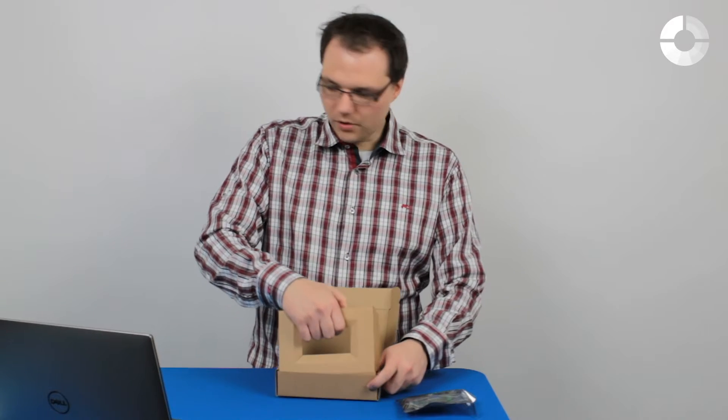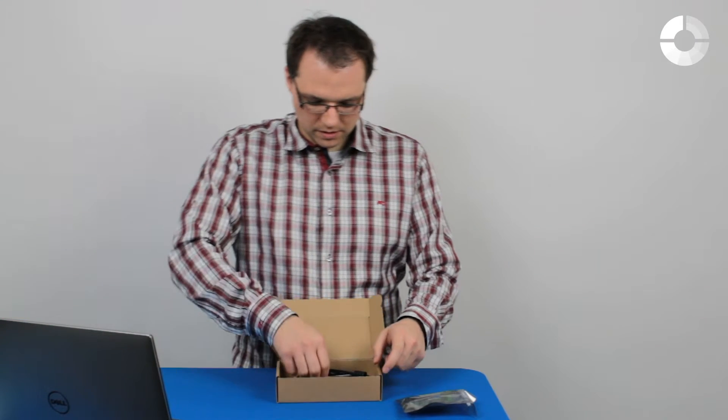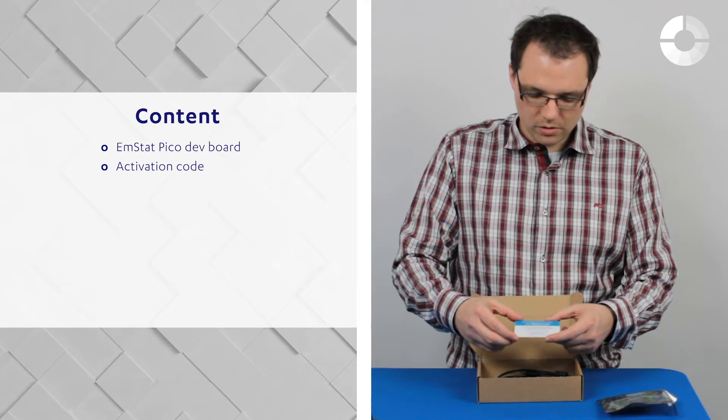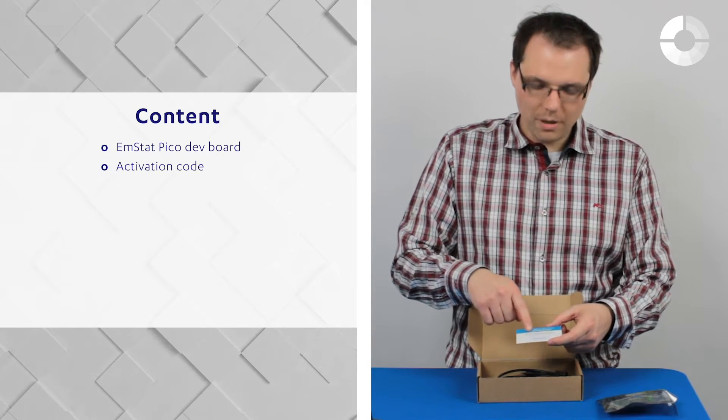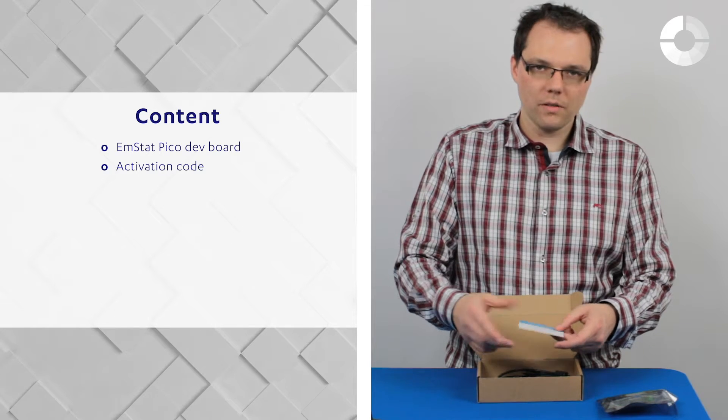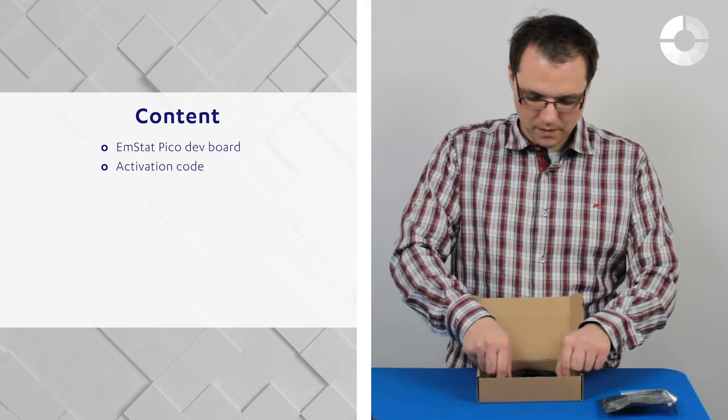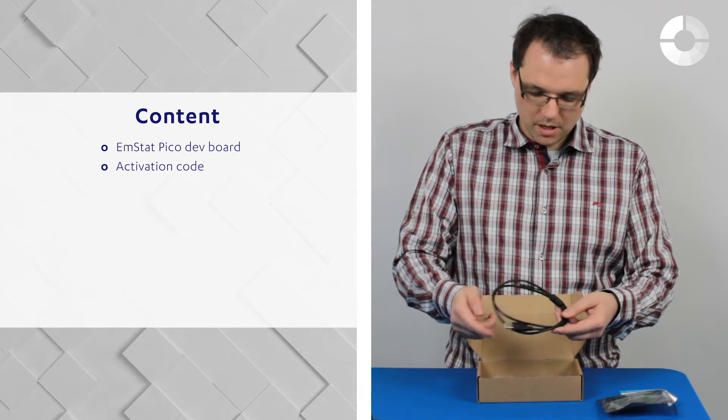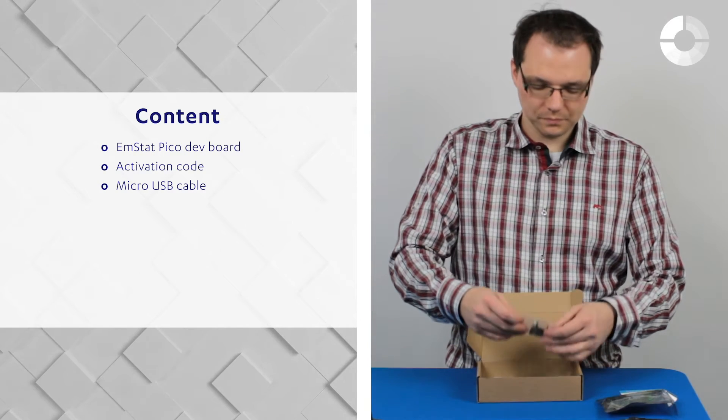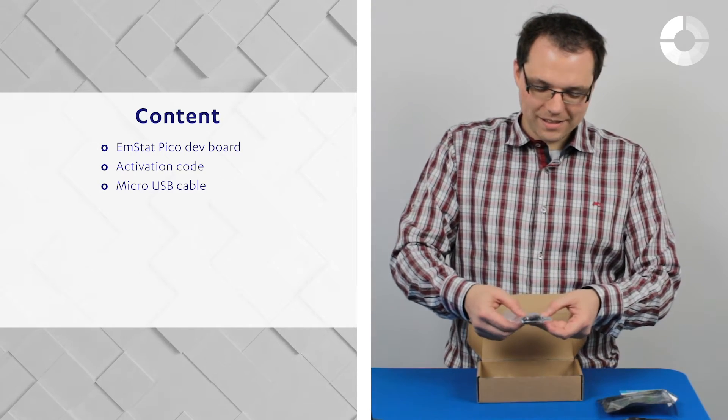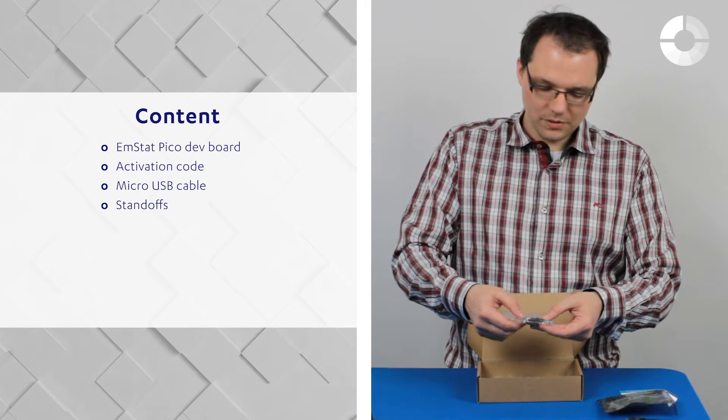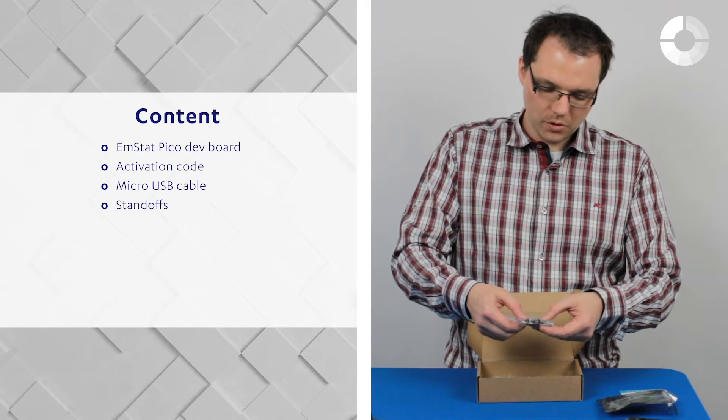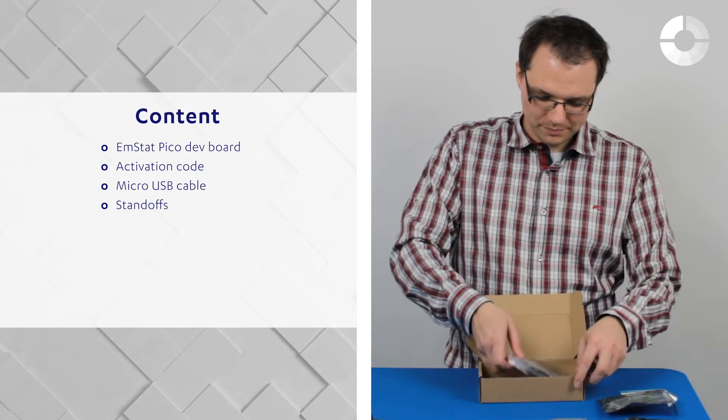You will find an activation code to download at my.palmsense.com the software PS Trace for Windows, a micro USB cable, some standoffs, an adapter for your SD card and a battery clip.